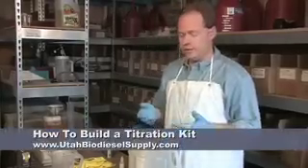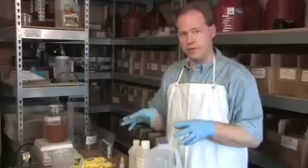To do a titration, we typically will build a titration kit. And what this consists of is everything that we need to make a titration and do one with.